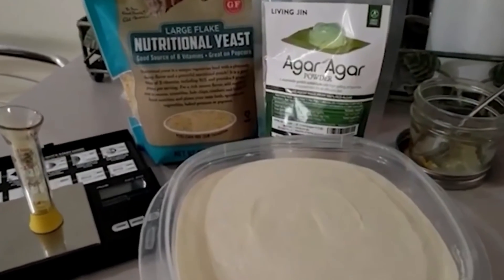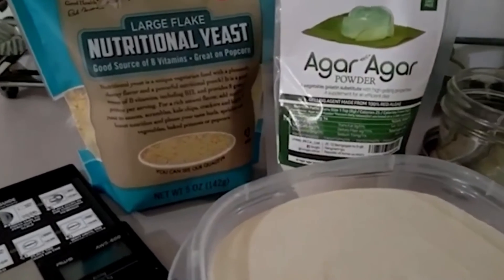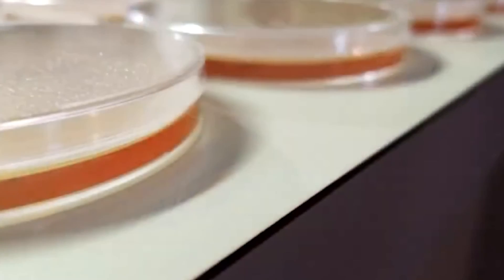MYA, or malt yeast agar, is an amazing agar recipe. This recipe gives the perfect nutritional source from the malt extract, but the addition of nutritional yeast will promote that booming rhizomorphic growth in your mycelium cultures.